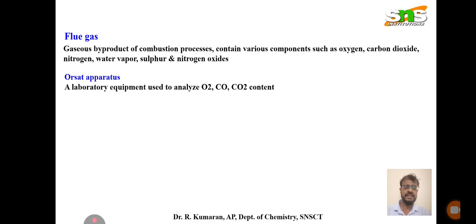It is a byproduct material obtained from the exhaust of completed chemical reactions, or we can say after the reactions the gas is going out. Some of the impurities present in those gases are called flue gas. So those impurities are getting absorbed or separated. That's the aim of the Orsat apparatus.